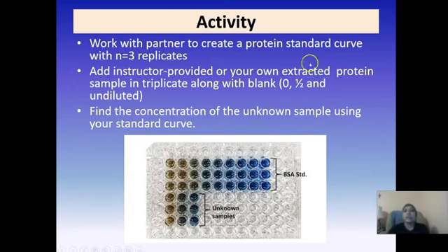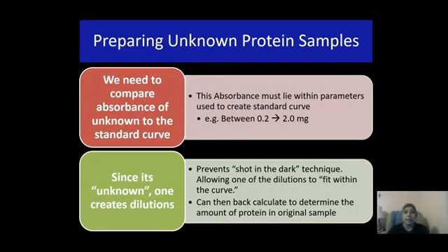You are going to take the standard curve that you create from your BSA standard dilutions, and you're going to utilize the equations from there to find the concentration of the unknown sample. And that's going to be your first exercise.